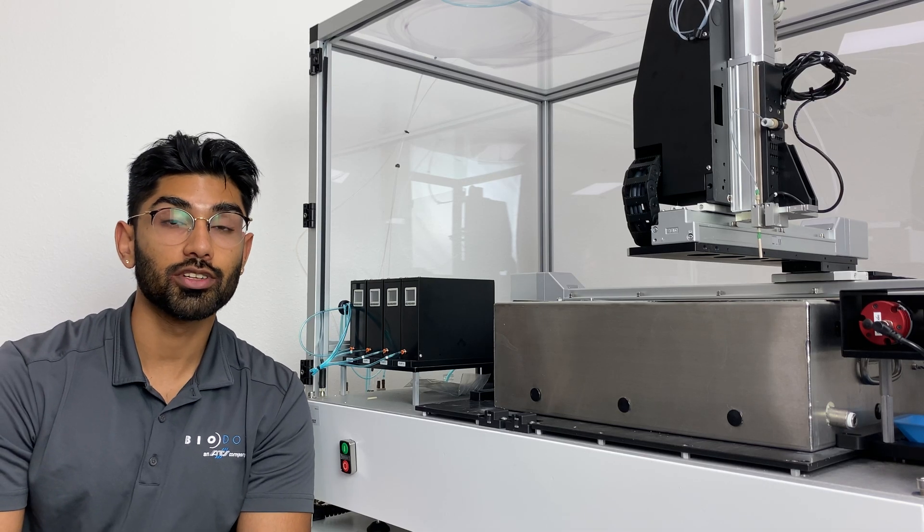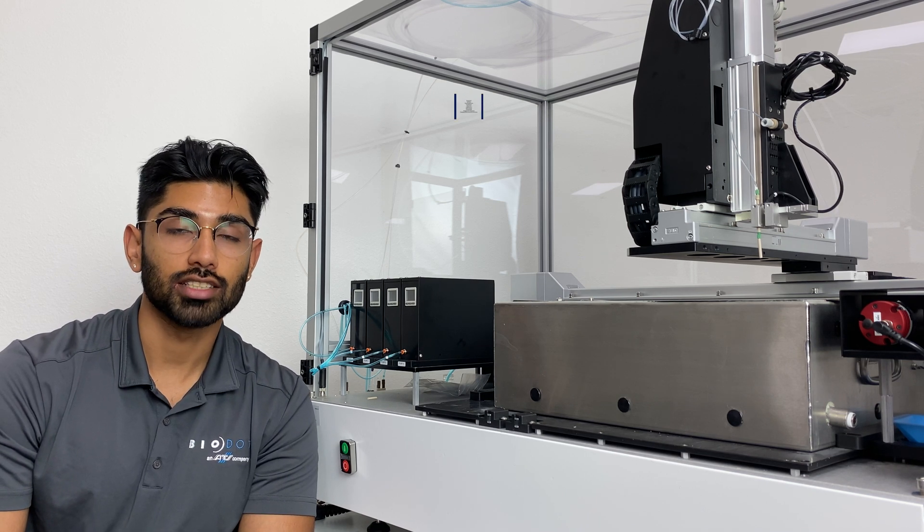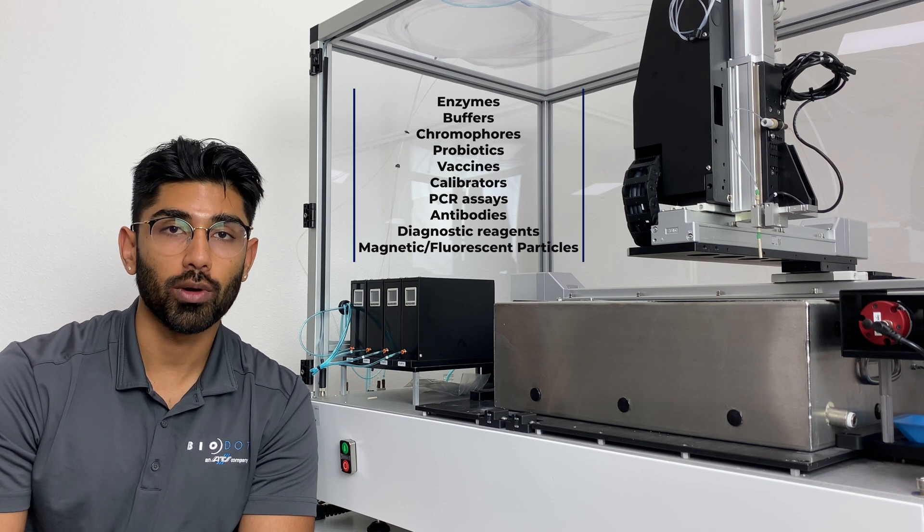There are several different types of solutions that can be dispensed with the Sphere technology, including diagnostic reagents, bacterial vaccines, assay buffers, probiotics, enzymes, substrates, and several more.